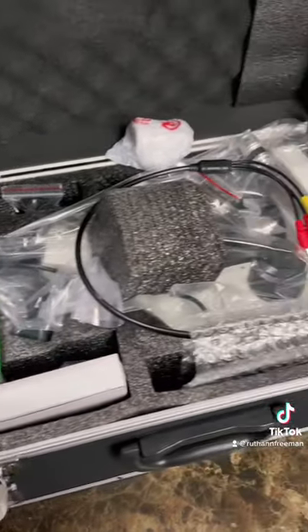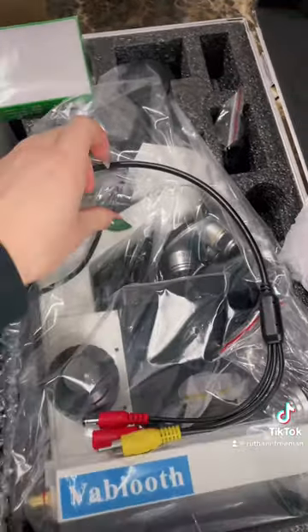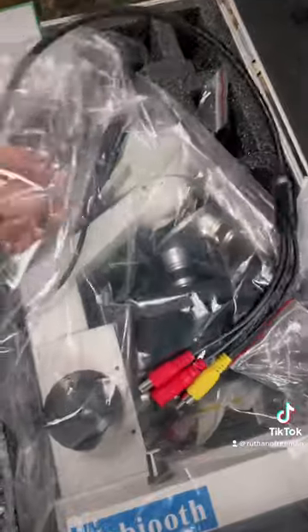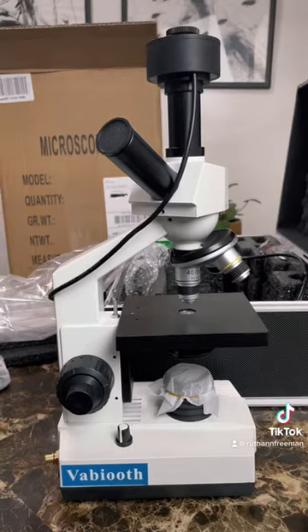It's important to know I spent weeks researching different microscopes and went with this one even though it was over $300, because I thought it had the best quality. Now I have never owned my own professional grade microscope, but I am familiar with how to use them as I've used them in the past, and I have many marine biologist friends who were helping me along the way.